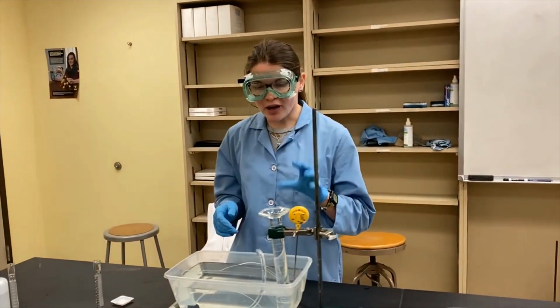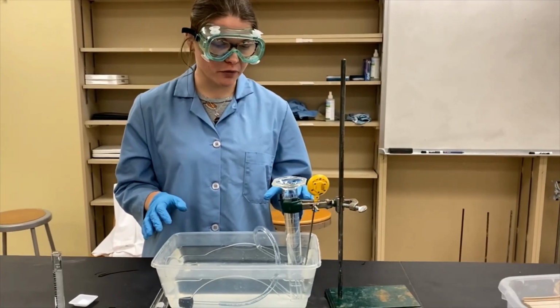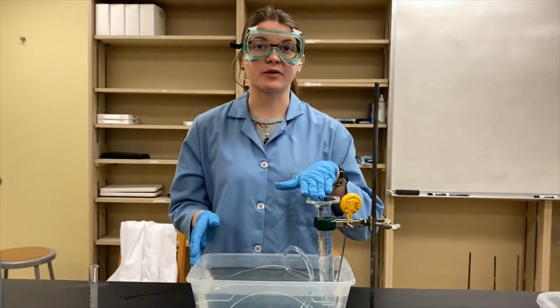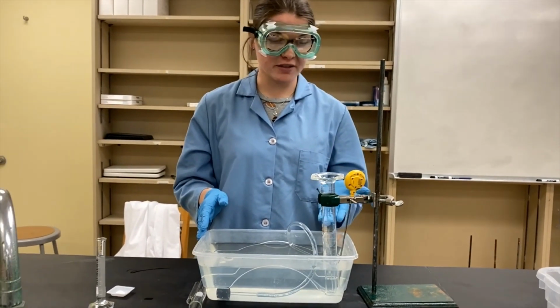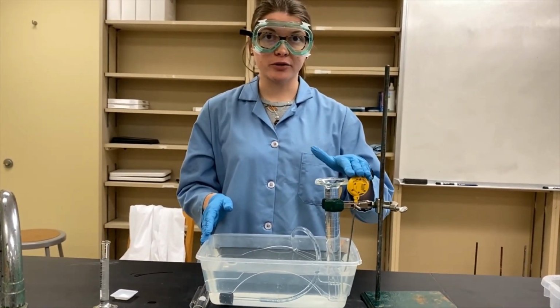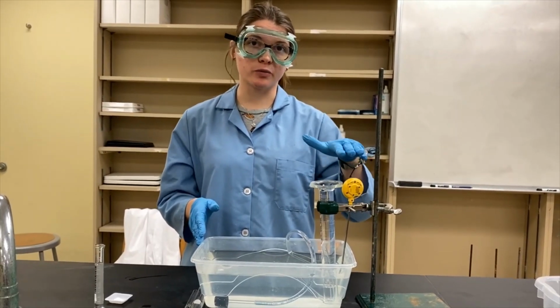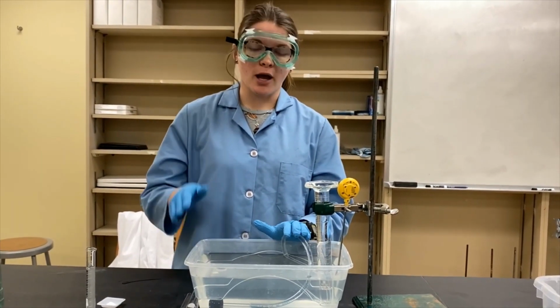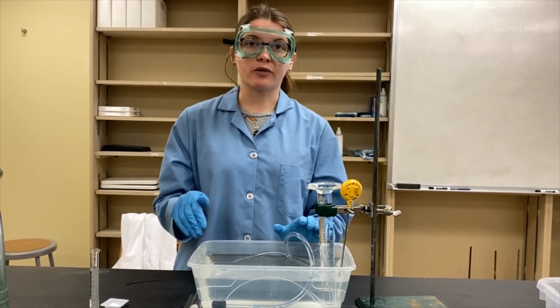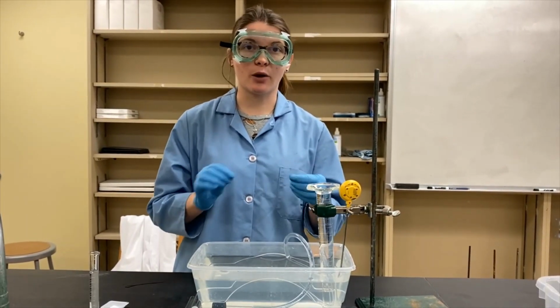So this is going to be our lab setup. We've prepped a few things for you. We have our 100 milliliter graduated cylinder. That's going to be where we're collecting and reading the volume of gas that we create. We have a thermometer so we can determine the temperature of the system, which we'll use in our calculations later. And we have a flooded tube here. We want to make sure we flood it with water first so there's no gas that's unaccounted for when we create the gas later.